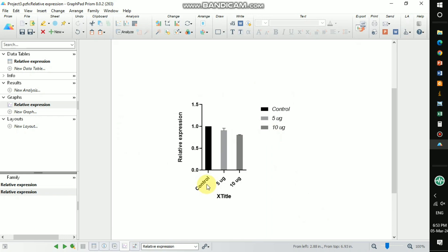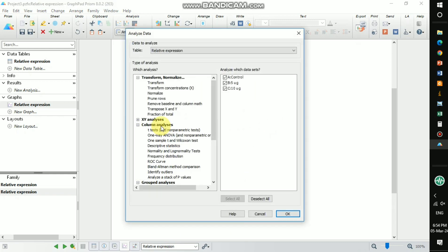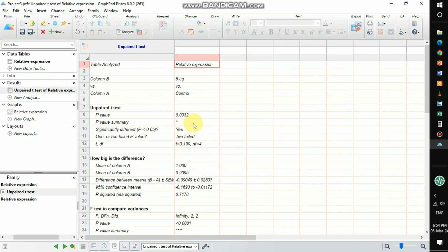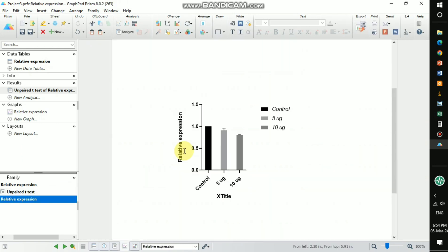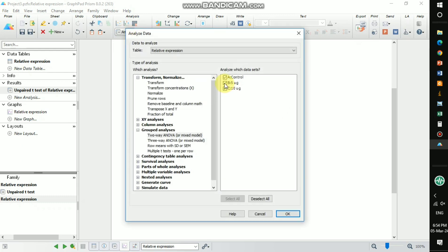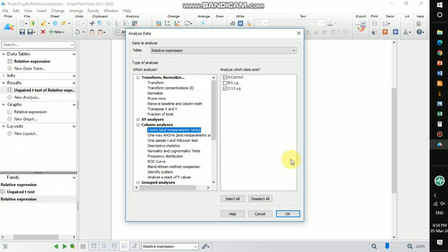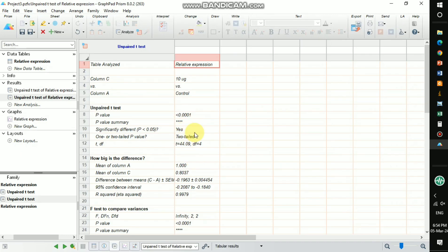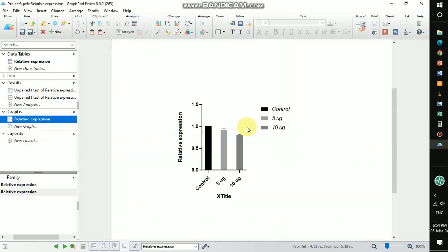You can see the control, 5 microgram, and 10 microgram as three different groups in the graph. To run a t-test, go to column analysis and select t-test — first compare control vs. 5 microgram using unpaired t-test. The result shows it is significant. Then compare control vs. 10 microgram using unpaired t-test — this is also significant. So both 5 microgram and 10 microgram are significant compared to the control group.